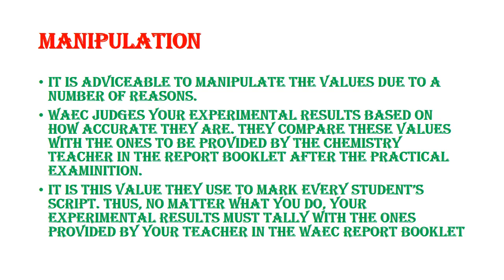The reason why the endpoint for different centers would vary, which was why WAEC brought out this system, is that we don't know the kind of chemicals used to prepare it. Different chemicals can have different amounts of impurities in them.